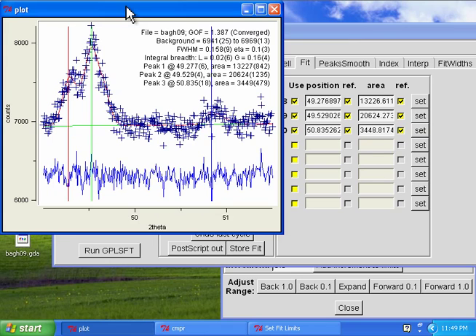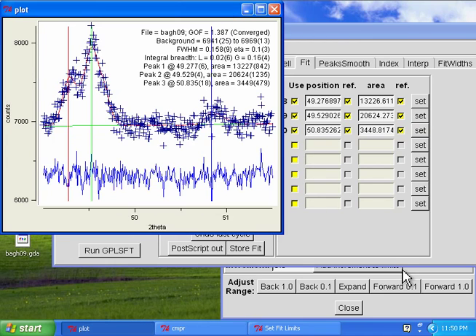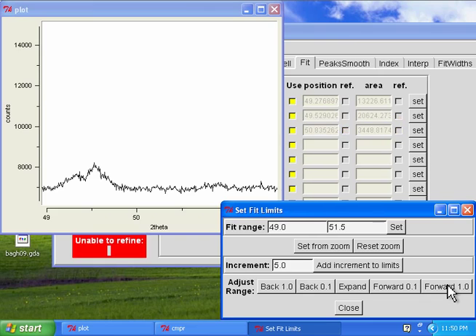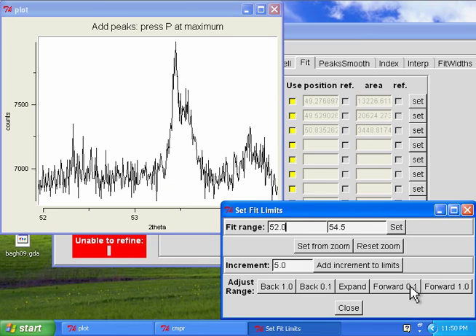All right, we are getting near the end. We're at 50-something degrees, and we've got 30 peaks. That's not bad. So let's go forward, and that looks like a good peak. Let's go forward a little more, see if we can get through here.